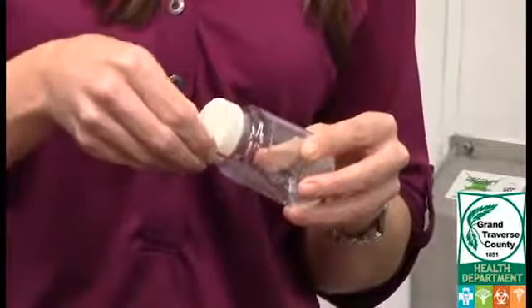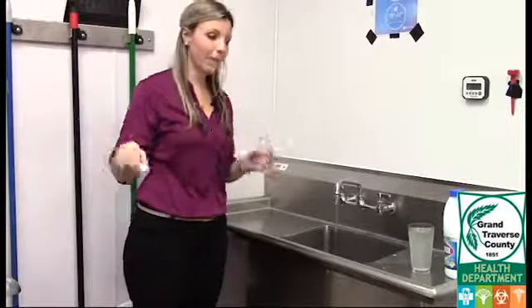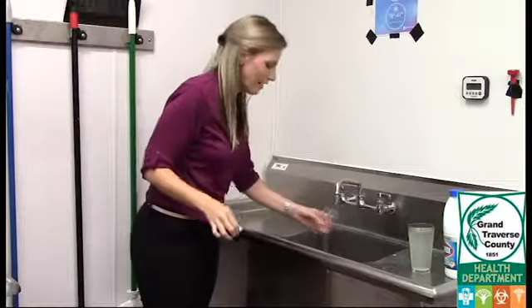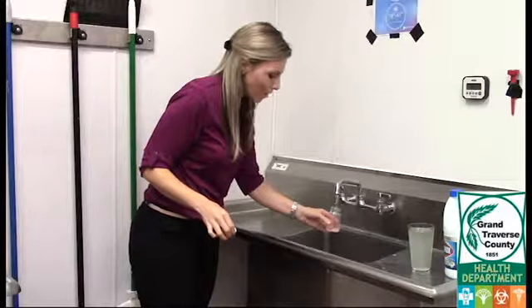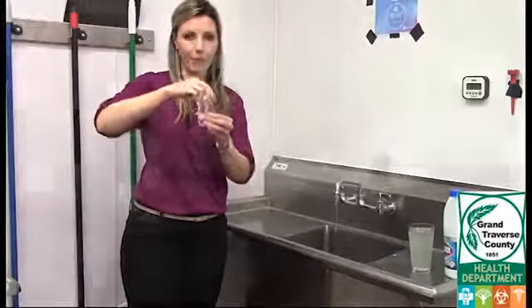Next, remove the seal from the sampling bottle, then unscrew the cap. Keep the cap in one hand face down and the bottle in the other. You don't want to touch it to anything because that could contaminate the sample. Fill the bottle up to the 100 milliliter mark, and as soon as you're done the cap goes immediately back on.